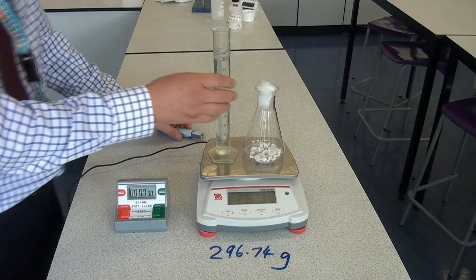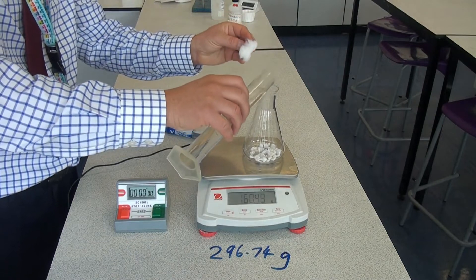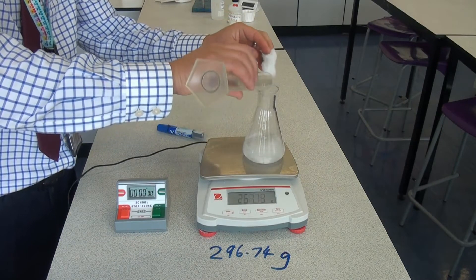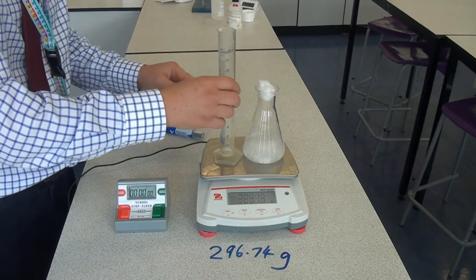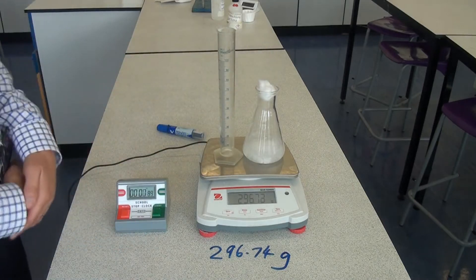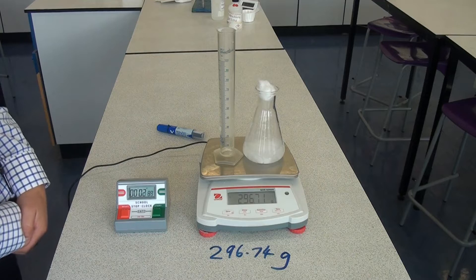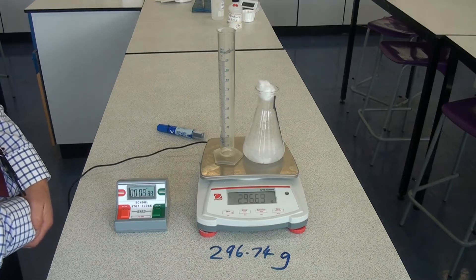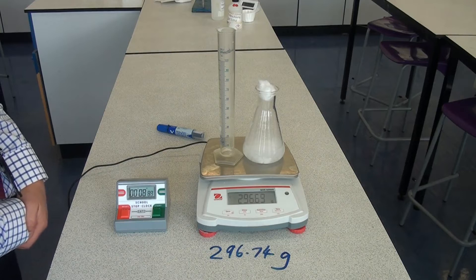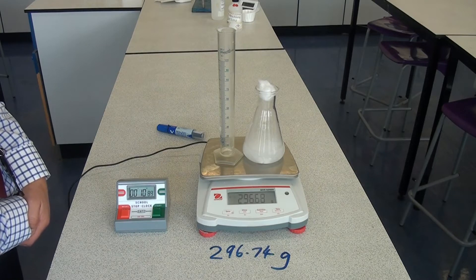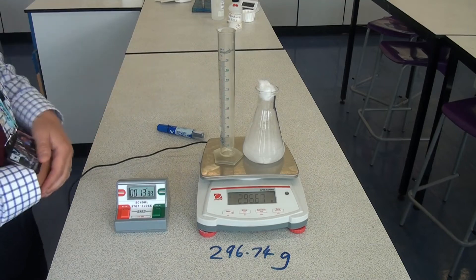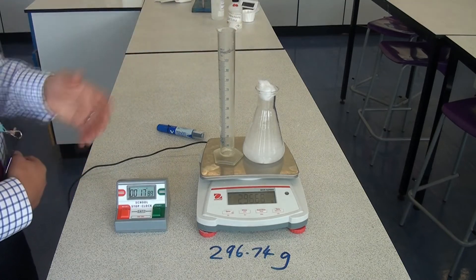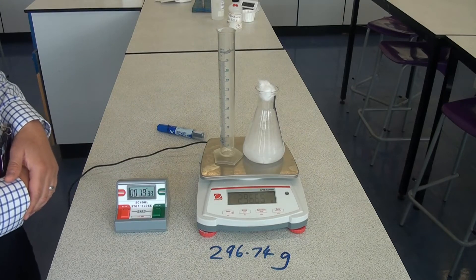I'm then going to mix the two reactants together and start the stopwatch. And then every 30 seconds, I would take the new reading of the mass. And it's already dropped from 296.74 to 296.68. And that's because, as the gas is being given off, gas molecules are escaping to the air and therefore the contents of the flask are getting lighter.